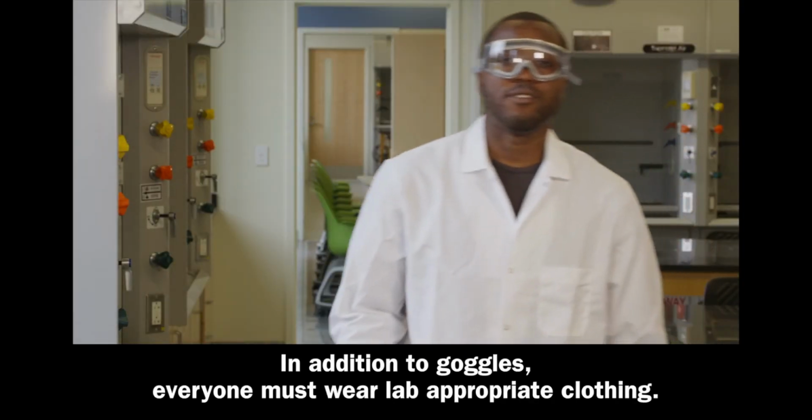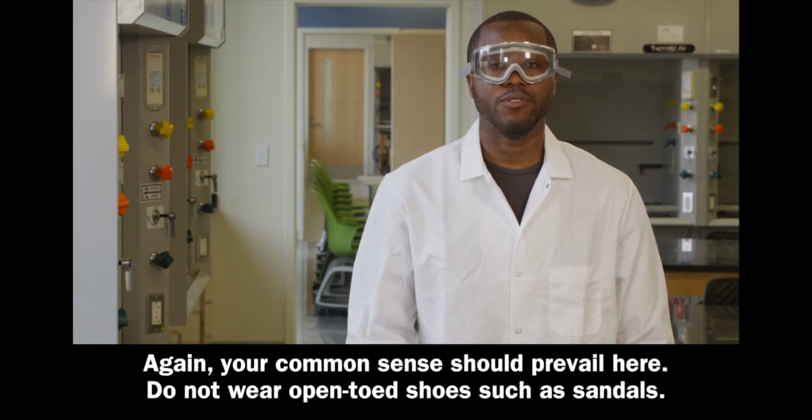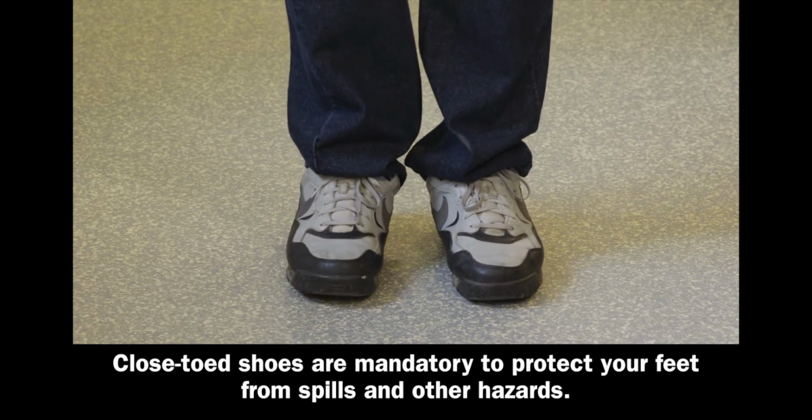In addition to goggles, everyone must wear lab-appropriate clothing. Again, your common sense should prevail here. Do not wear open-toed shoes such as sandals. Closed-toed shoes are mandatory to protect your feet from spills and other hazards.